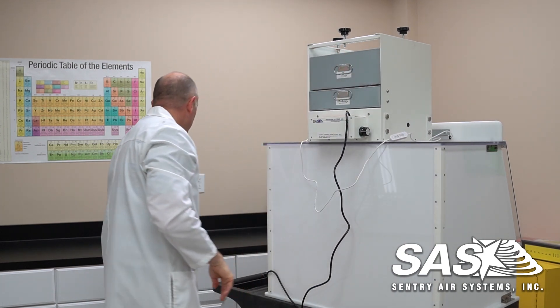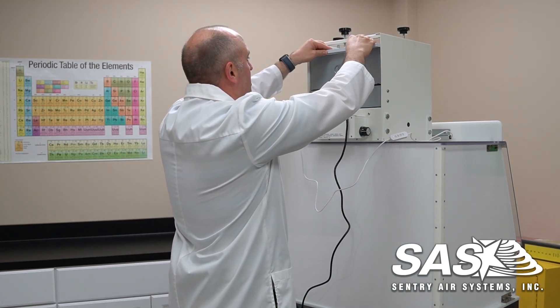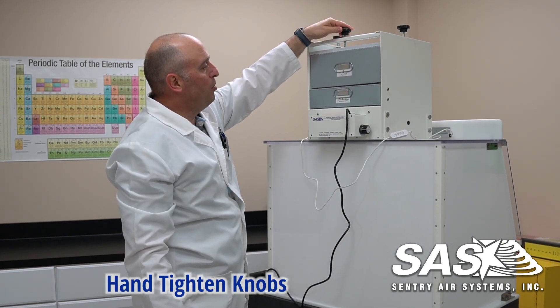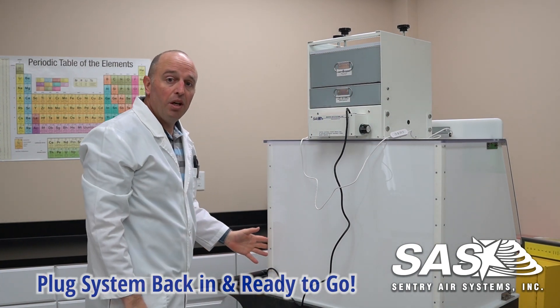And lastly you want to get your spacer frame and slide this in. Then tighten the knobs just enough to get enough pressure on there to seat the gaskets. From there you can plug your system back in and you're ready to go.